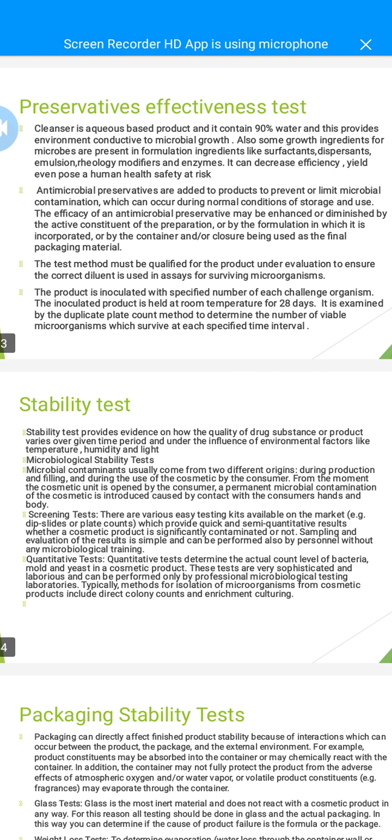Then we come to the stability test. The stability test provides evidence on how the quality of a drug substance or product varies under different environmental factors like temperature, humidity, and light at given time intervals. Next, the microbiological stability test.